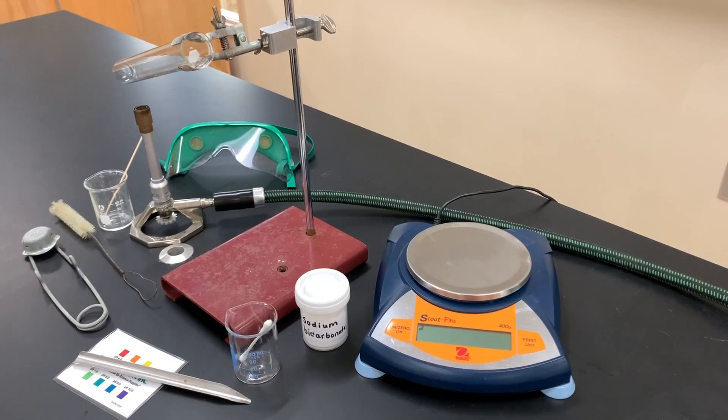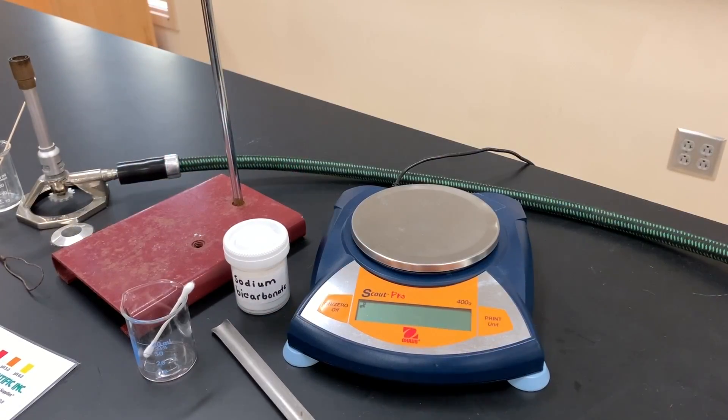In this video I'm going to decompose sodium bicarbonate into three products. We're going to take masses and use percent yield stoichiometry calculations to prove the identity of those three products. Step one is to turn on your electronic balance and make sure that goes to zero and that gram is the unit that's listed.